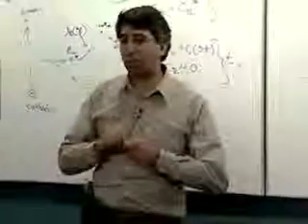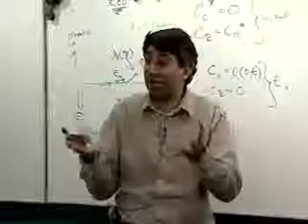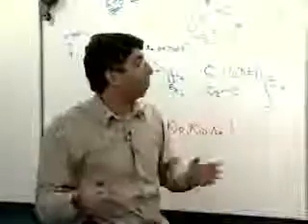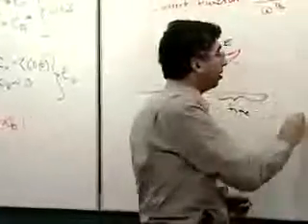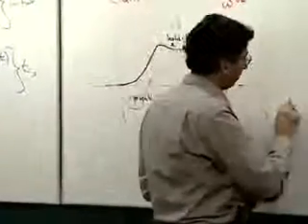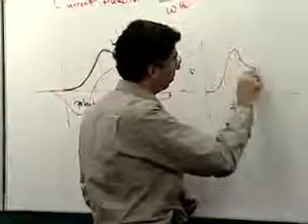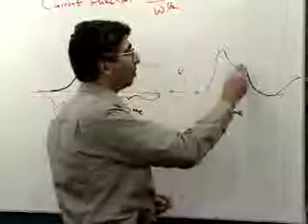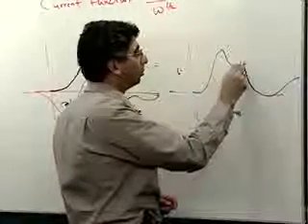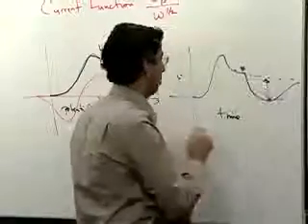Now, it used to be actually a very easy way to do it. In the day of XY recorders and strip chart recorders, this was very straightforward. You could either use a strip chart recorder, in which case you get the unfolded cyclic voltammogram, like that, and then you would just run a second one, but hold at that potential. That makes it very easy.